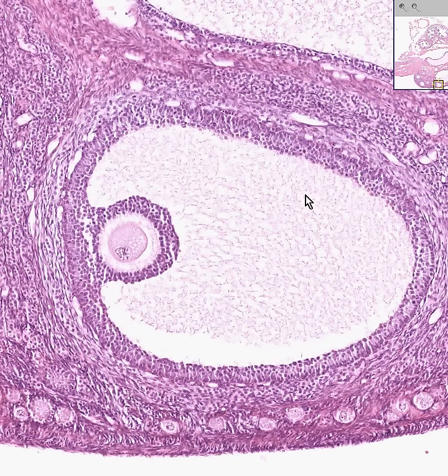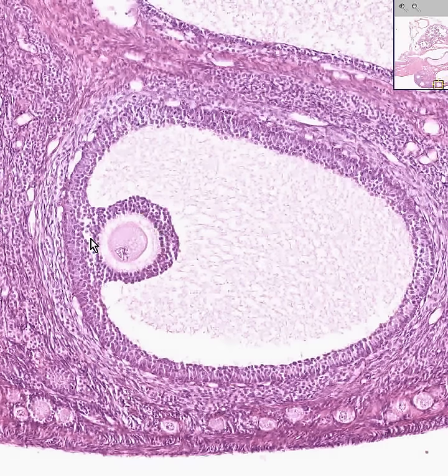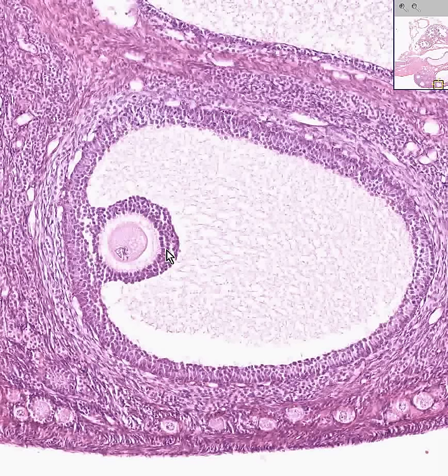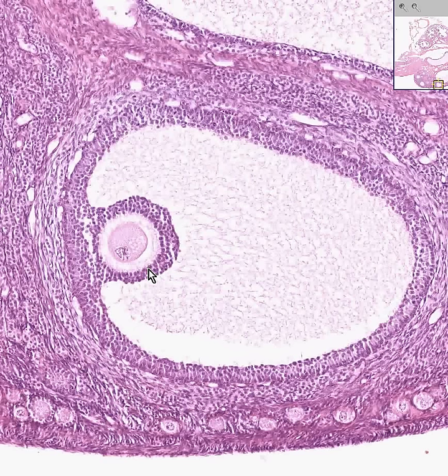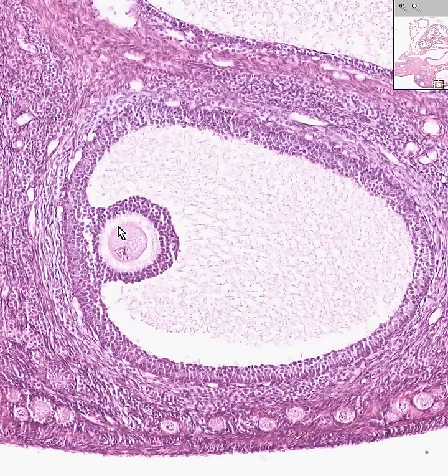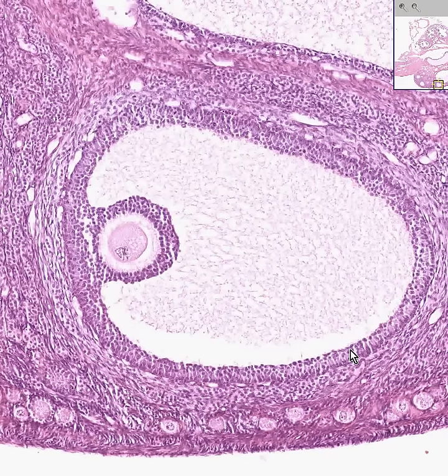A Graafian follicle has a large antrum, a lot of granulosa cells surrounding the whole follicle, and a lot of granulosa cells surrounding the ovum — generally called the cumulus oophorus. Here is the actual ovum, this may be some remnant of a zona pellucida, here are the granulosa cells surrounding the ovum, and here are the granulosa cells surrounding the follicle, with this large space in between being liquor folliculi.